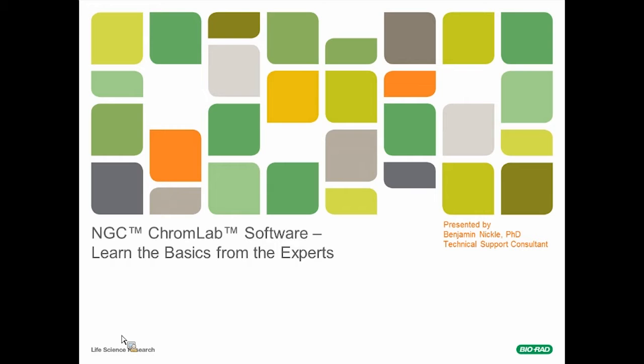The title of today's webinar is ChromLab Software: Learn the basics from the experts. The goal of today's webinar is to provide you with the necessary information to navigate and use the software. Today I'll introduce you to the major software features, after which you'll be able to operate your NGC in manual or method mode and run a basic analysis of the resulting chromatograms.